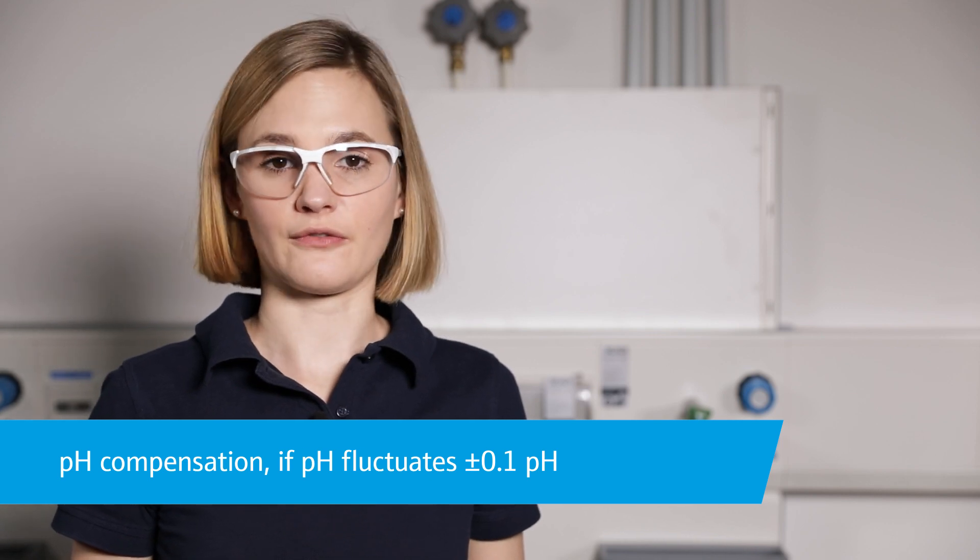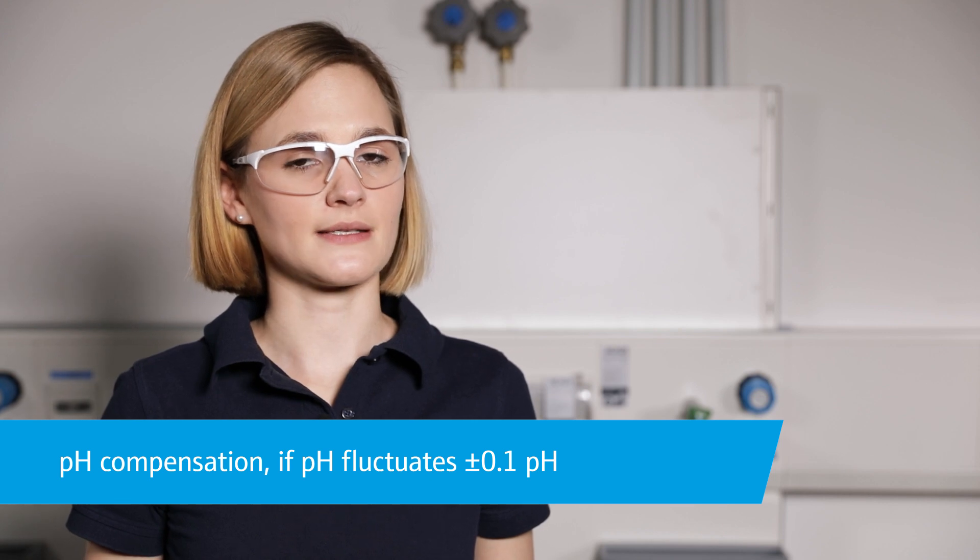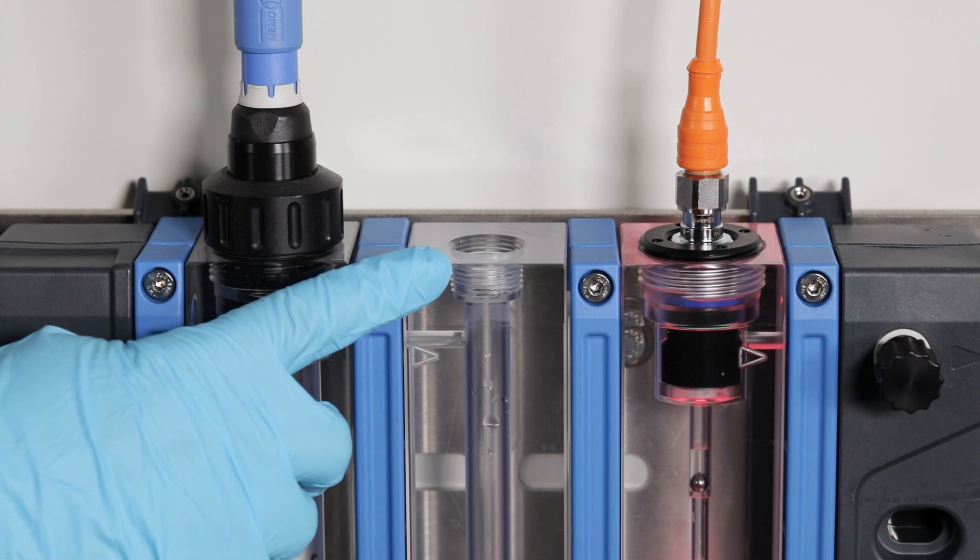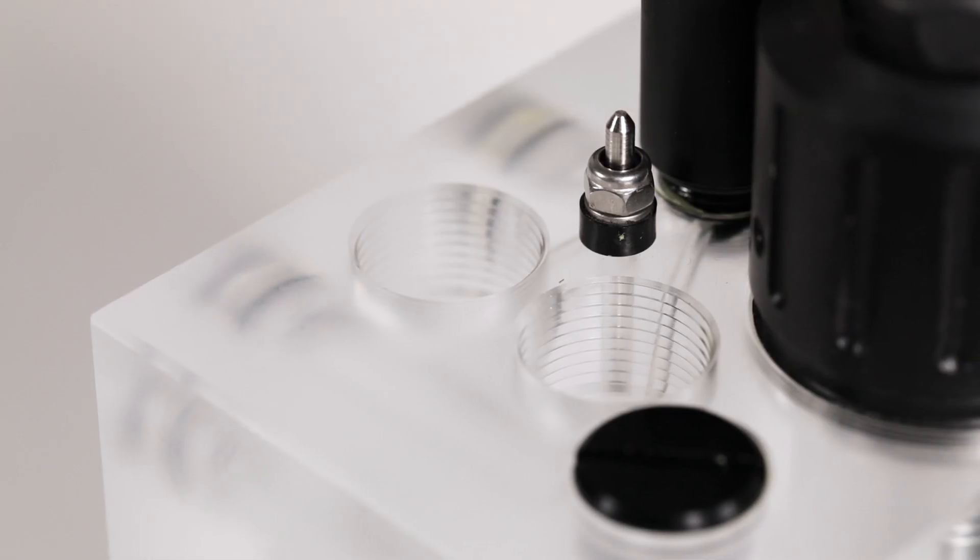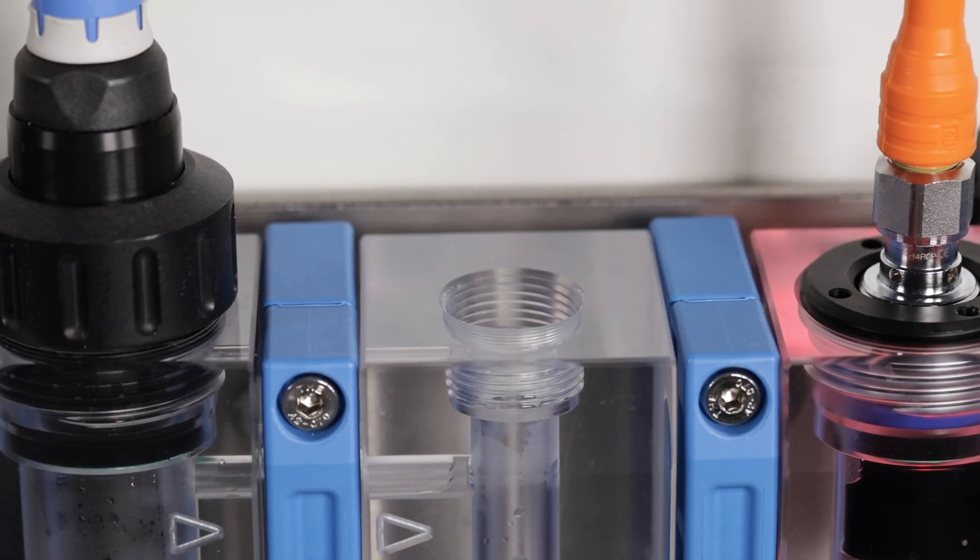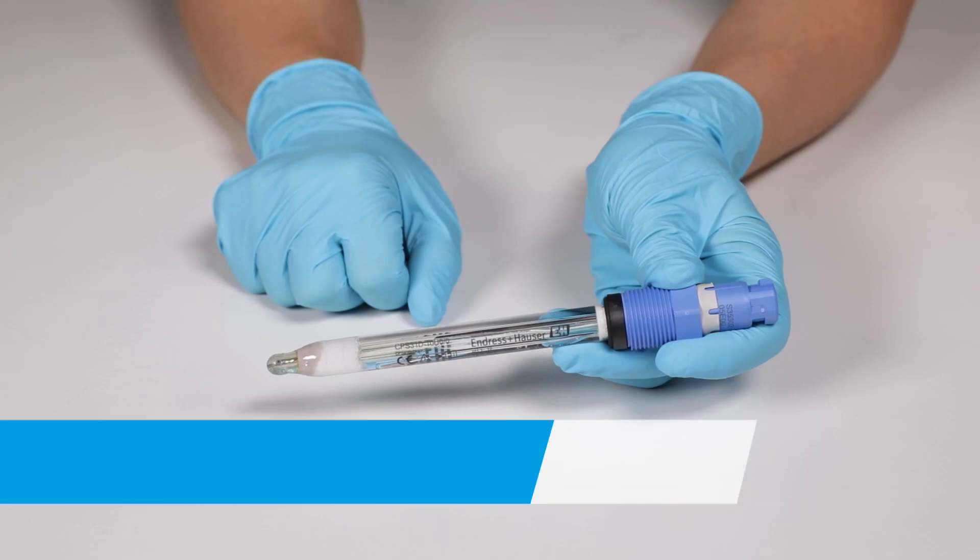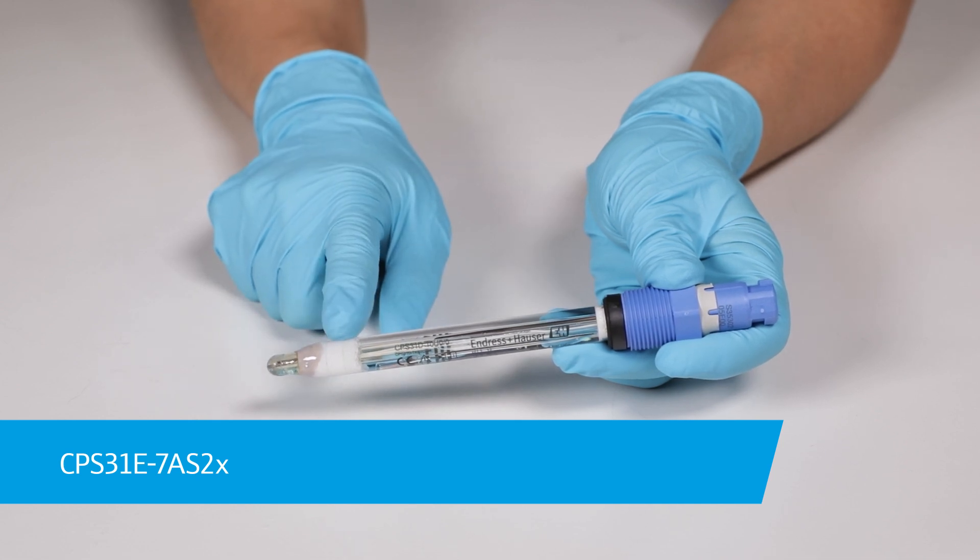As the free chlorine measurement is pH dependent, a pH compensation is recommended if the fluctuation of the pH value in water exceeds plus minus 0.1 pH. In this case use the flow assembly Flowfit CYA27 or the former CCA250. They are designed to accommodate all sensors needed for accurate disinfection measurement and control. For disinfection applications and drinking water the CPS31E with salt ring is recommended.